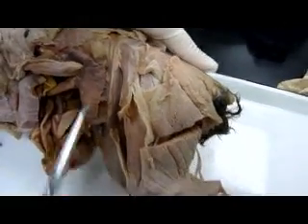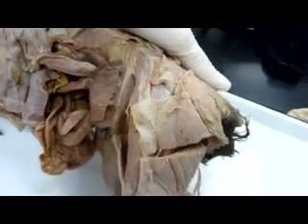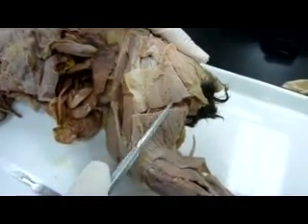Tensor fasciolata, all that, and then the biceps femoris is the big thing that's cut.